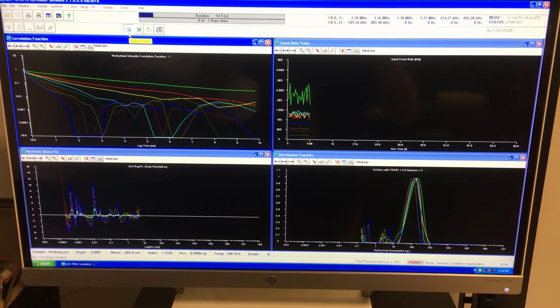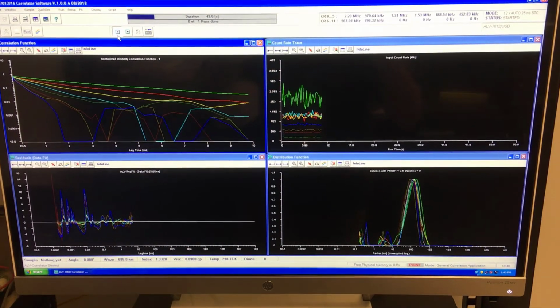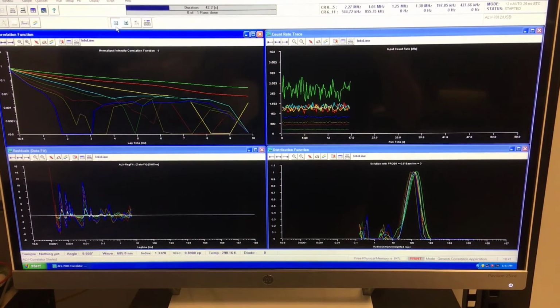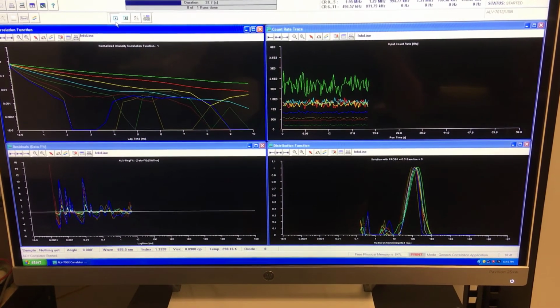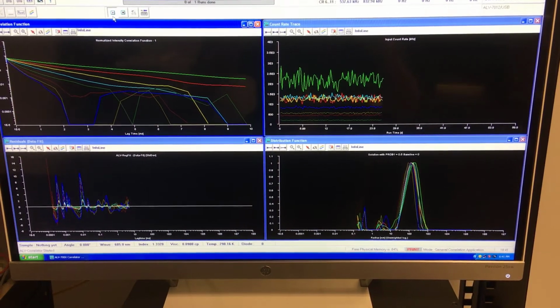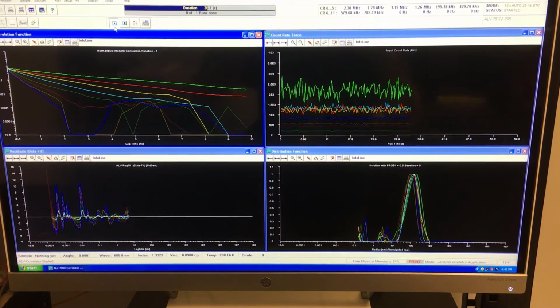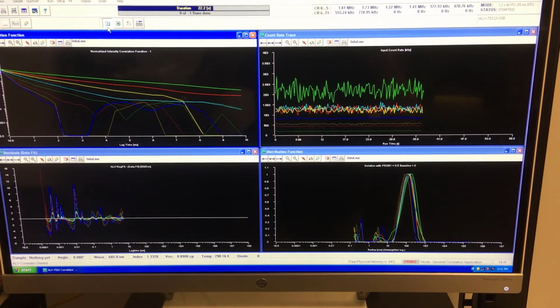Here we're looking at the semi-log plot, and now I've started the device to run. And what you'll see over here in this trace on the right panel is that the intensities are being traced out. You'll notice that the lowest scattering angle, which is in bright green, seems to have larger fluctuations. And that's a little bit deceptive. They are larger because the intensities on the ALV software are gathered at 400 millisecond time intervals.